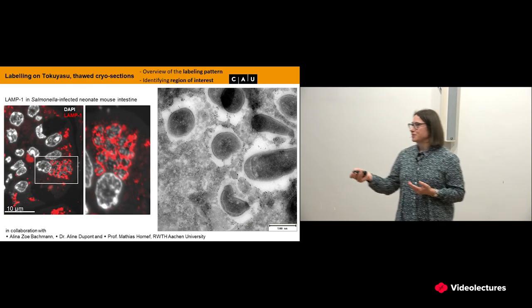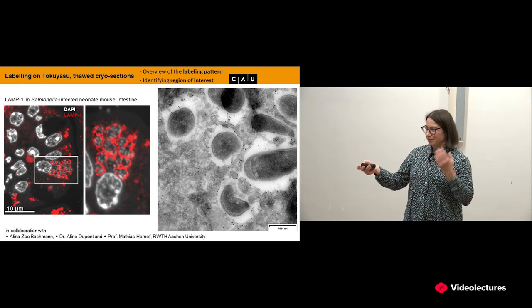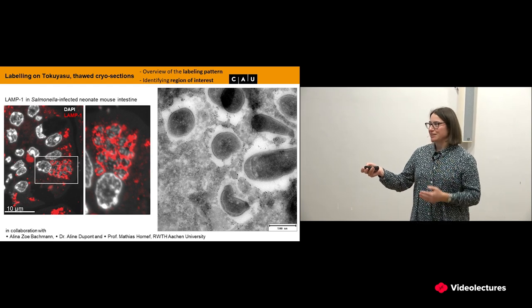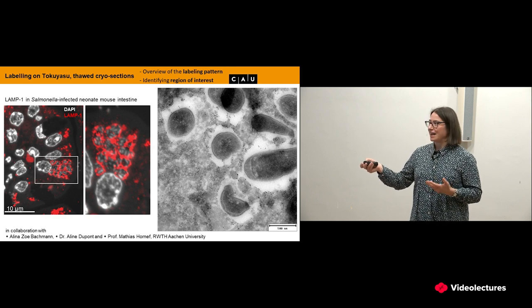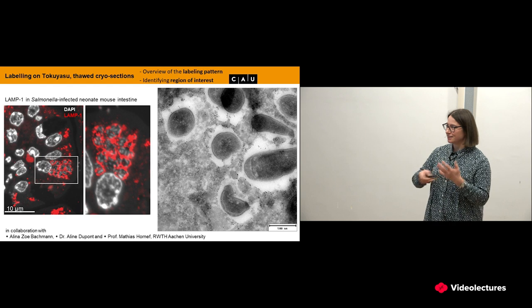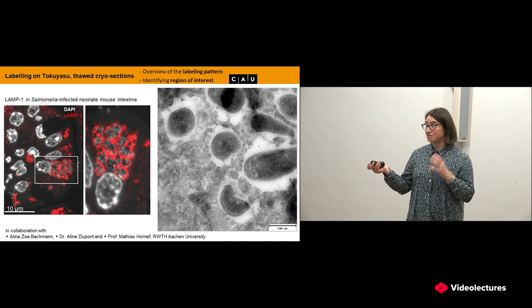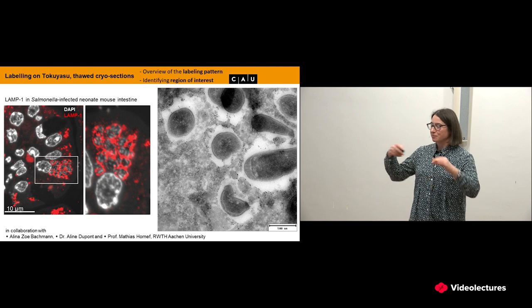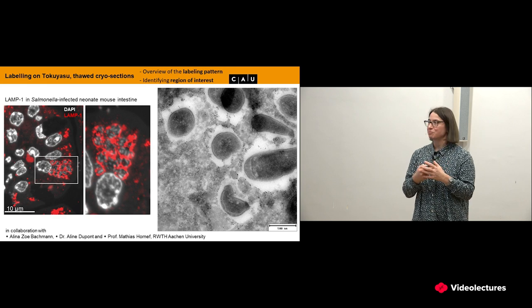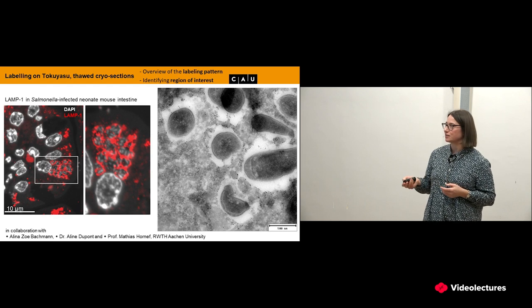And these are the examples again. As I said, I always do immunofluorescence LAMP. And again, when the group would do this on whole mount, they would just see a blob above the nucleus. And when I tried to convince them, no, this Salmonella containing vacuole is not a simple blob. This is a very structured vacuole. What does it mean? It has a lot of membrane finger projections, because it's the membrane where the bacterium interacts with the host cell and produces effectors that modify its destructive potential.